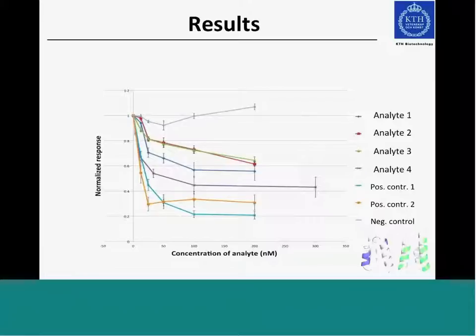And then as you go down here, these are ABD molecules that are being injected. So we have 4 of them here: the red, green, the dark blue, and the purple. And as you can see, they are leveling out at different levels on the y-axis. And these are actually lining up in order of affinity. So the higher the affinity, the lower you get on the y-axis.